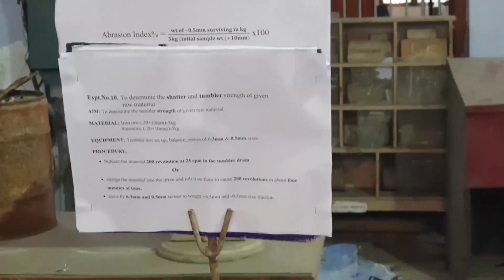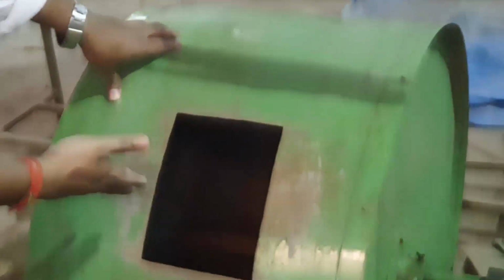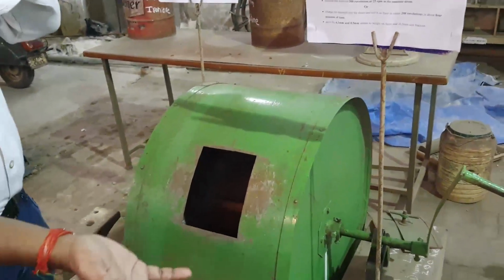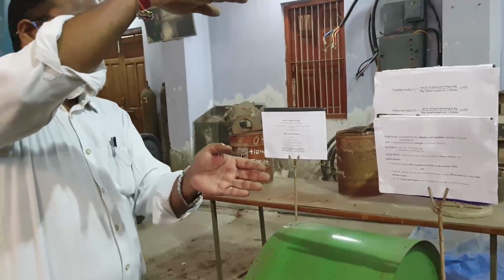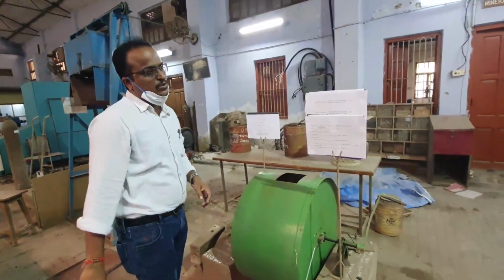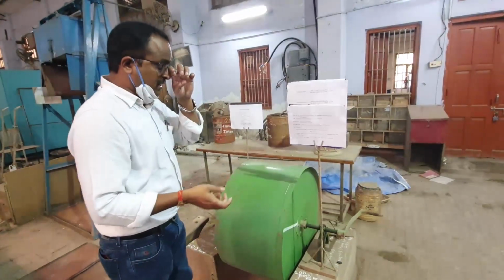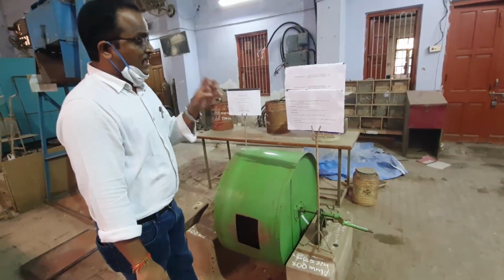Here the material, how is it falling? When we put the material inside the drum, inside there are steps, there will be lifters. The lifters lift the material up to this height. Whenever it reaches that height, the material will fall. When the material falls from a certain height, it is subjected to impact. Due to this impact, the material will break down. So we are checking this susceptibility of the material to breakdown under impact force.